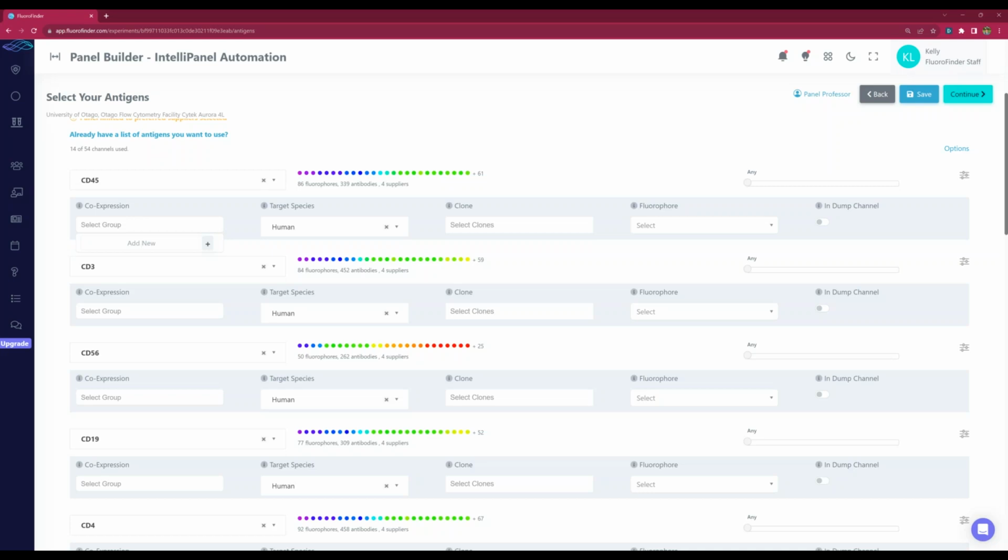So here, for example, if this is CD45, I could say that this is CD4 T cells. And then I could say this is my Tregs, and you just press return to make it go faster. Then I'm going to group all of these into the T memory subsets. Theoretically, you can load as many co-expression groups as you want, because what it's going to do is take those co-expression groups and find the lowest complexity index within each of them.